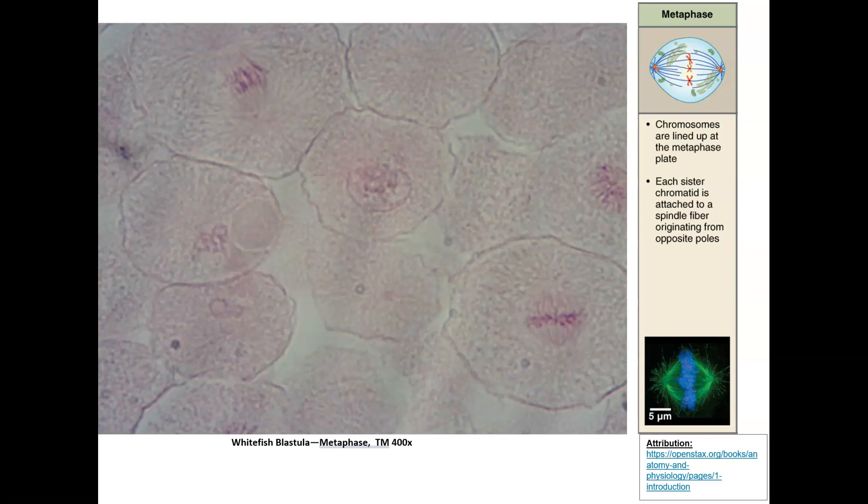Now we're looking at metaphase, the second phase of mitotic division. The major thing that happens here is the chromosomes — sister chromatids connected by their centromeres — line up at the equator of the cell. That might not seem like much, but think about why it's important: if chromosomes were scattered as pairs throughout the cell, you couldn't guarantee each new cell gets exactly the same chromosomes. It would be like a traffic jam — chaos isn't good for a living thing that needs to create the same cells for the same purposes.